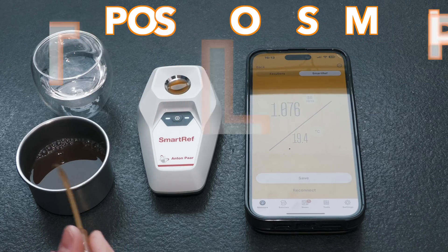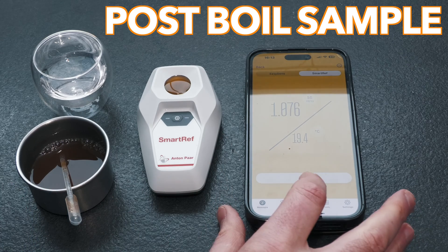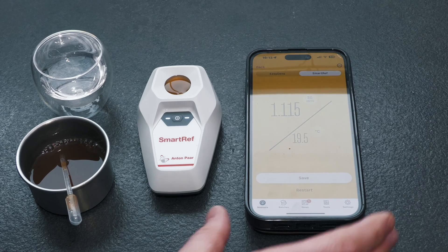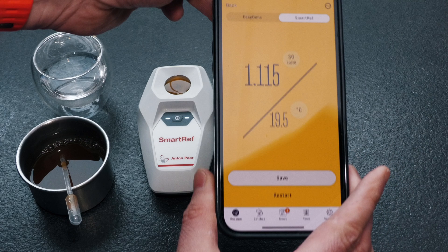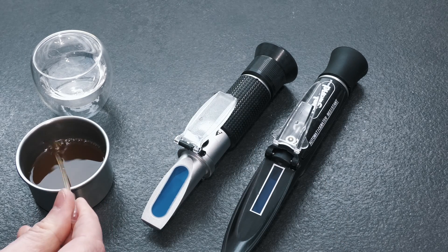It was then time for our post-boil sample, which was collected after adding extra sugar and finishing the boil, so we can expect this one to be a fair bit higher in gravity compared to the previous sample. Our second sample has an accurate reading of 1.115 specific gravity. If this was a beer that finished at 1.010 SG, then we would have a beer that is almost 14% ABV, so this is certainly a high-end sample.